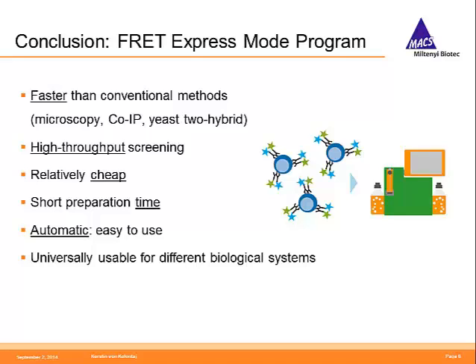You do not have to do all the calculation steps, which are really complicated, but you simply press play and then the gating and also the calculation is done by the program automatically. And this program is really universally usable for different biological systems, so not only for T-cell activation, but you can also study pathway activations, and you can study protein-ligand interactions, which might be really interesting for the identification of new pharmaceutical drugs.